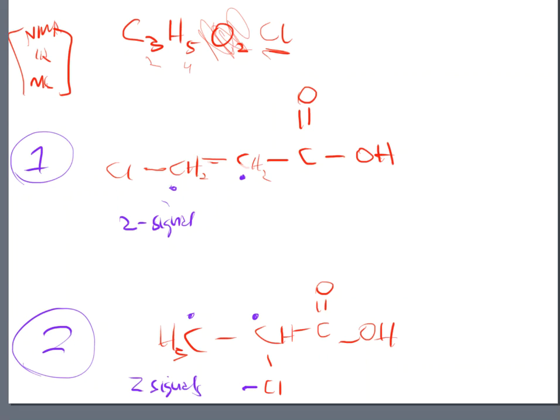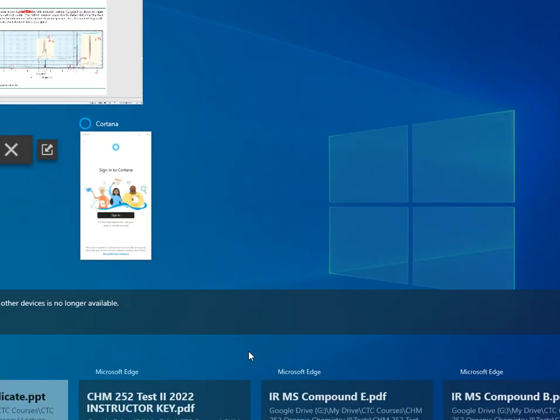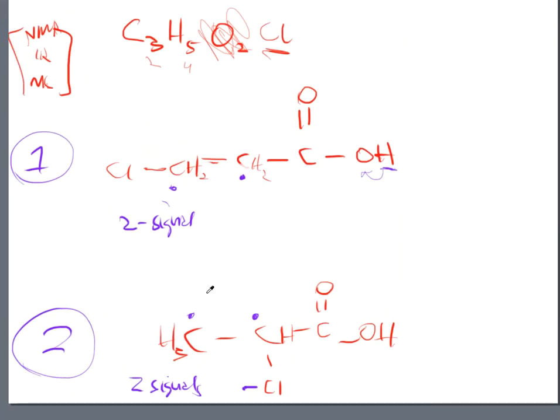That is a proton, right? So yeah, we do have some protons. We've got a proton here, but that's not on a carbon. It's on an oxygen. There is a chance that something like that will show up. It's going to be very weak, and that's probably where that third signal is coming from that they squeezed back onto the chart. But as far as the major signals in the main space of the NMR, they're coming from these 2 carbons that we've drawn here.